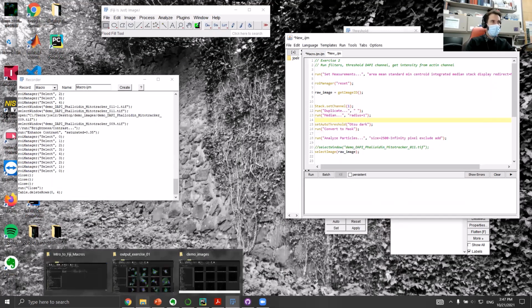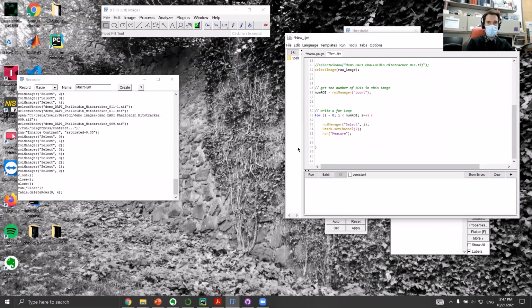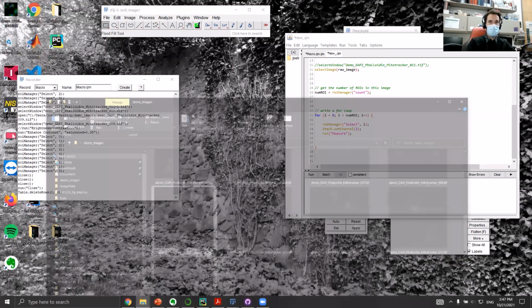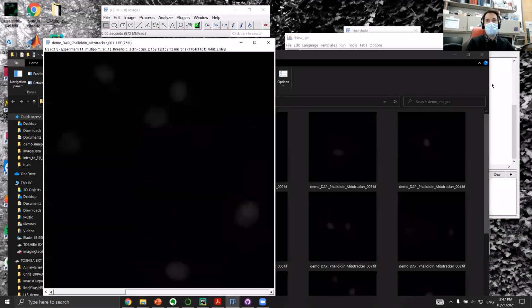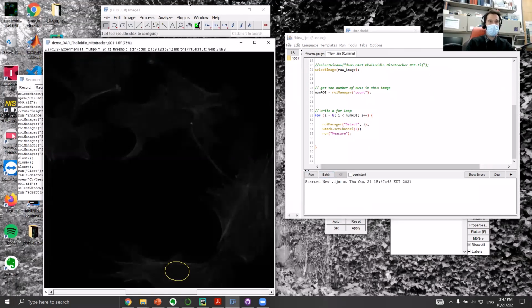And then if we just start from scratch, if everything's there, if you pasted everything in, see if this works. I'm going to choose one of my raw demo images. I think we forget on which one we worked. I think it was 11. Let's just take number 1. And then if we say run, hopefully a bunch of stuff happens.